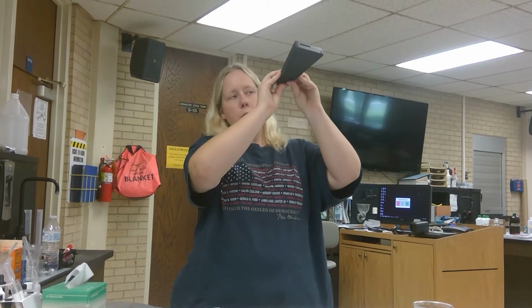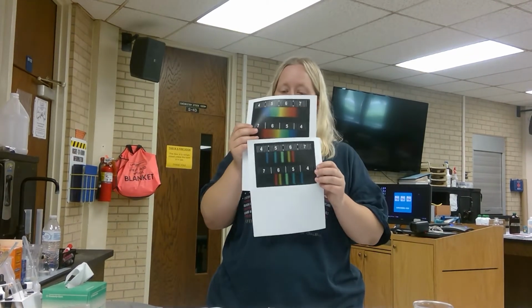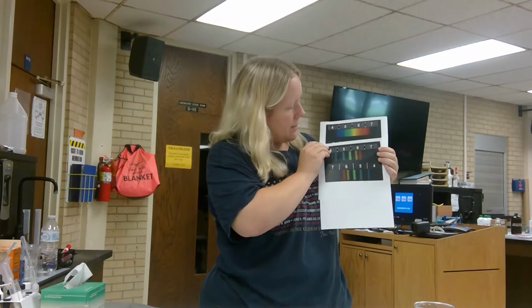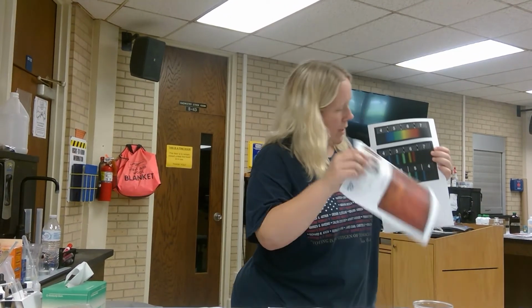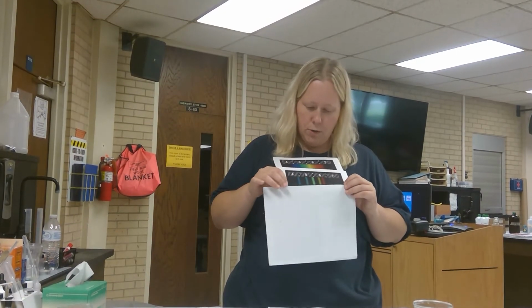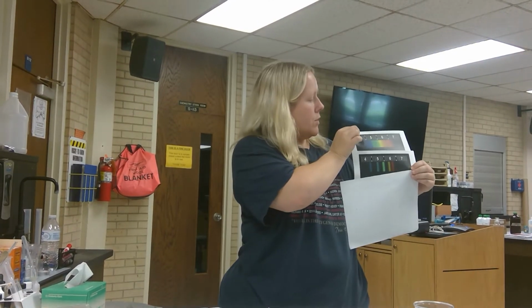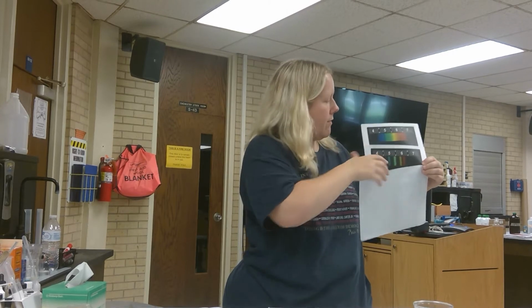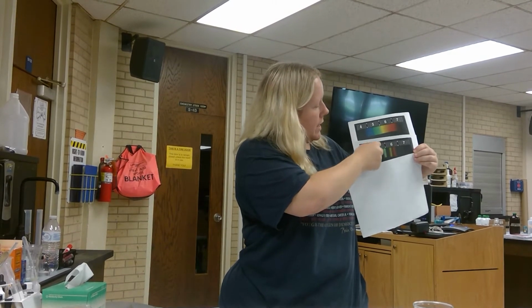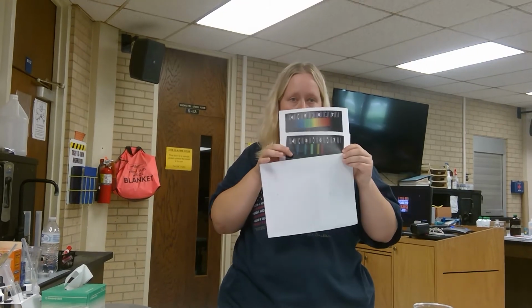And as you point this up to your light source, what you should see is something that looks like this, or potentially looks like this. And I'm going to hide that bottom portion. Okay. So you should be seeing one of those two types of graphs. Either this one here, and your 4 is going to be on the left, so it's going to be 4 to 7 from left to right, or you're going to see this one here from 4 to 7. Whether you see the colors blended together or separate distinct lines.